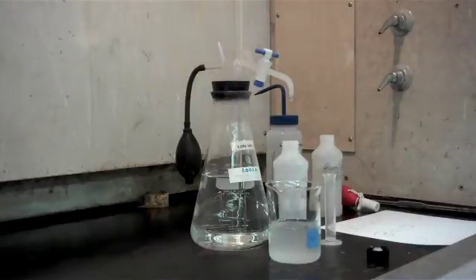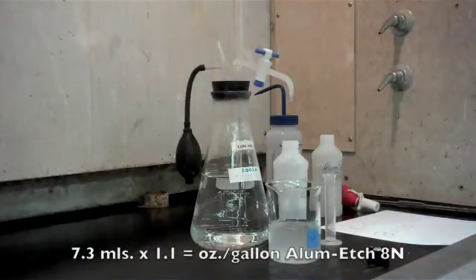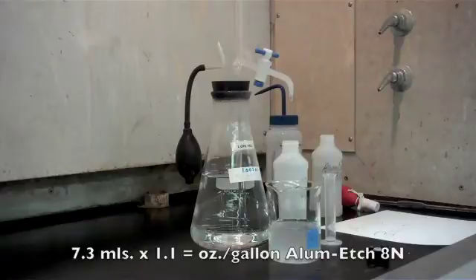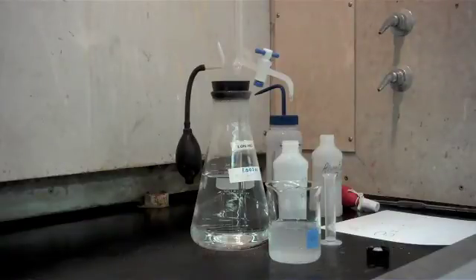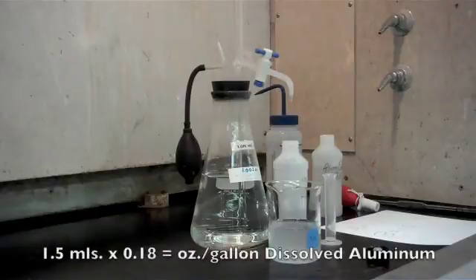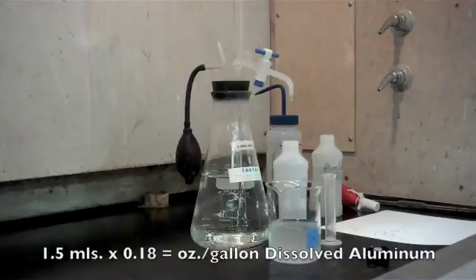So our first endpoint was 7.3 mils. We're going to multiply that by 1.1, and that will equal our ounces per gallon concentration of etch. Then the second endpoint that we got is one and a half mils. We're going to multiply that by 0.18, and that will give us ounces per gallon as dissolved aluminum as contamination in the bath.